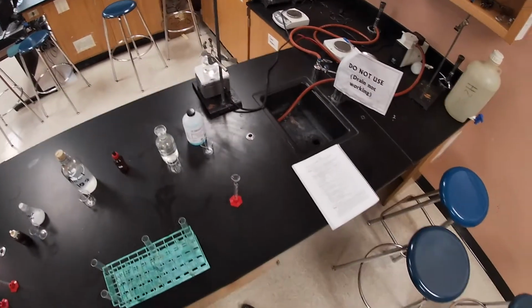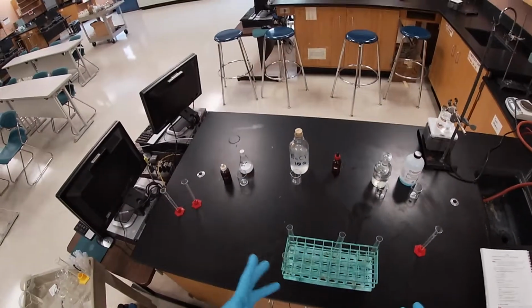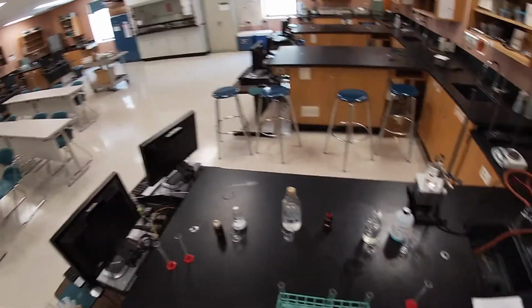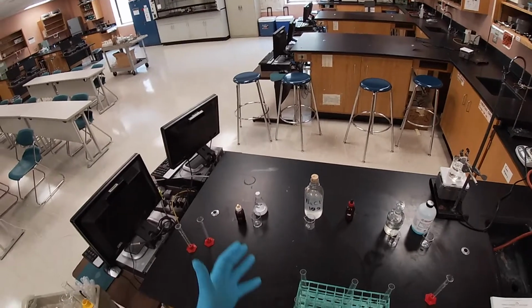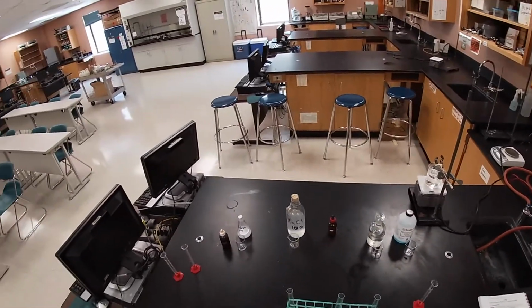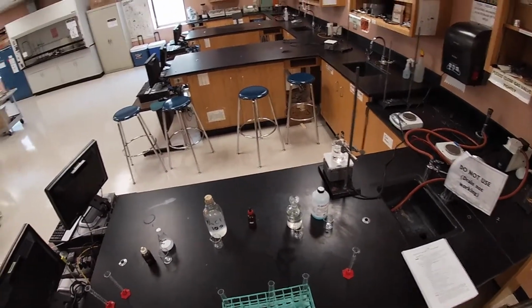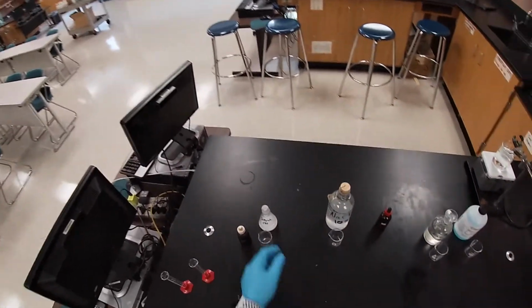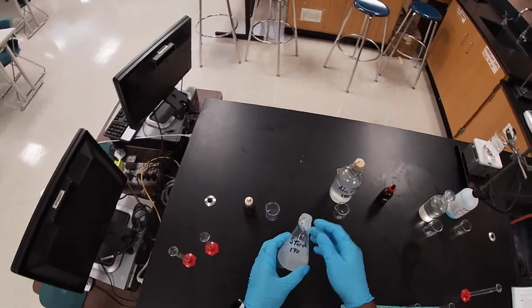So first and foremost, before we start our actual experiment, we need to see what we're going to look for, and we need to see what to expect in order to determine whether the tests are positive for a starch, chloride ion, or for sugar. If of course we see nothing, then we will consider those tests to be negative for those respective substances that we're looking for.